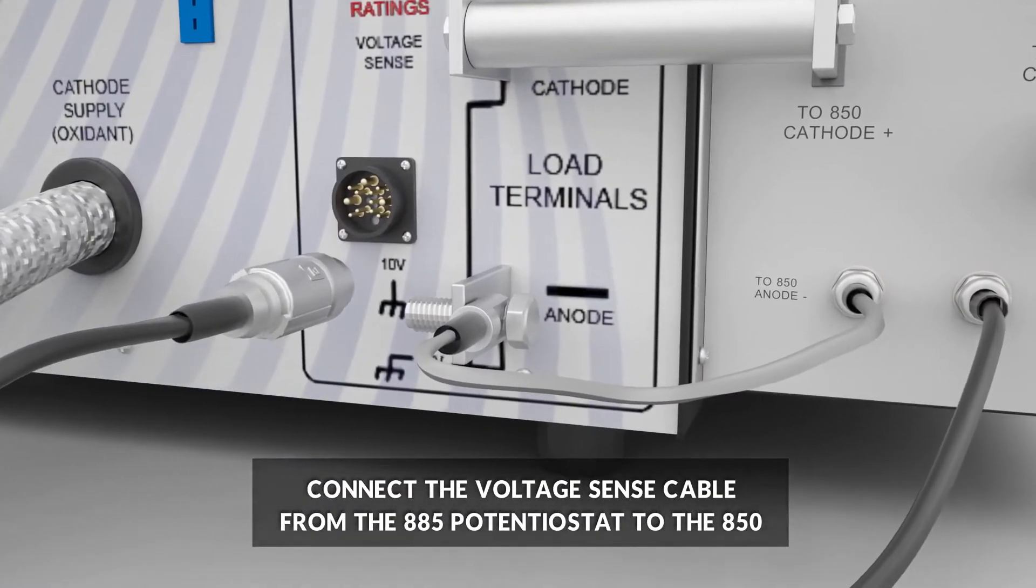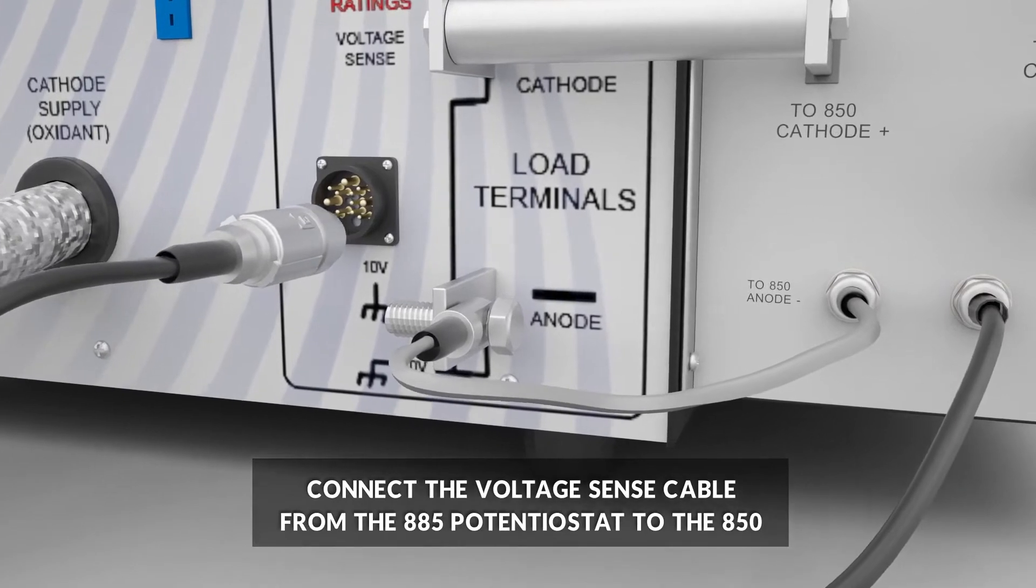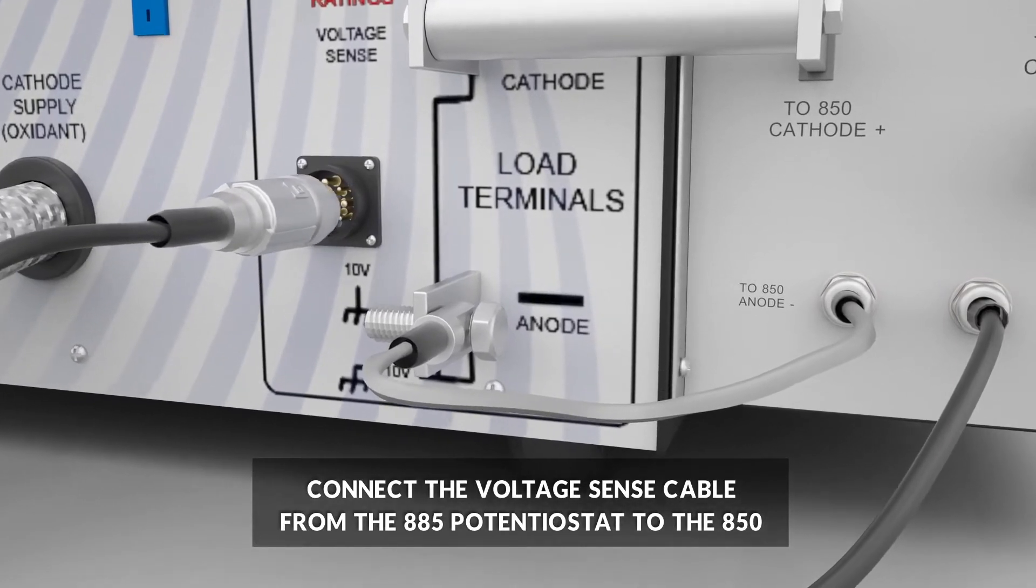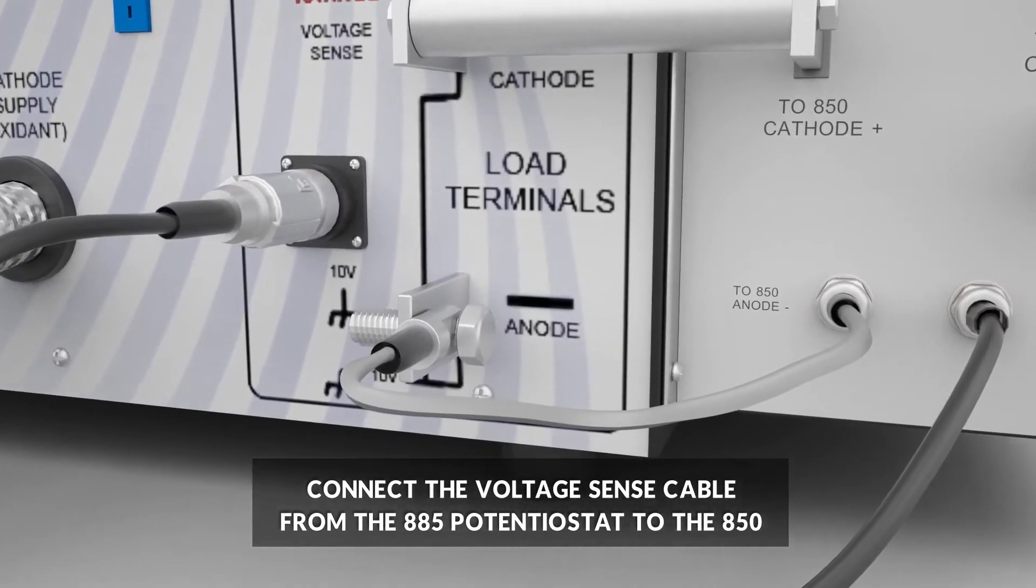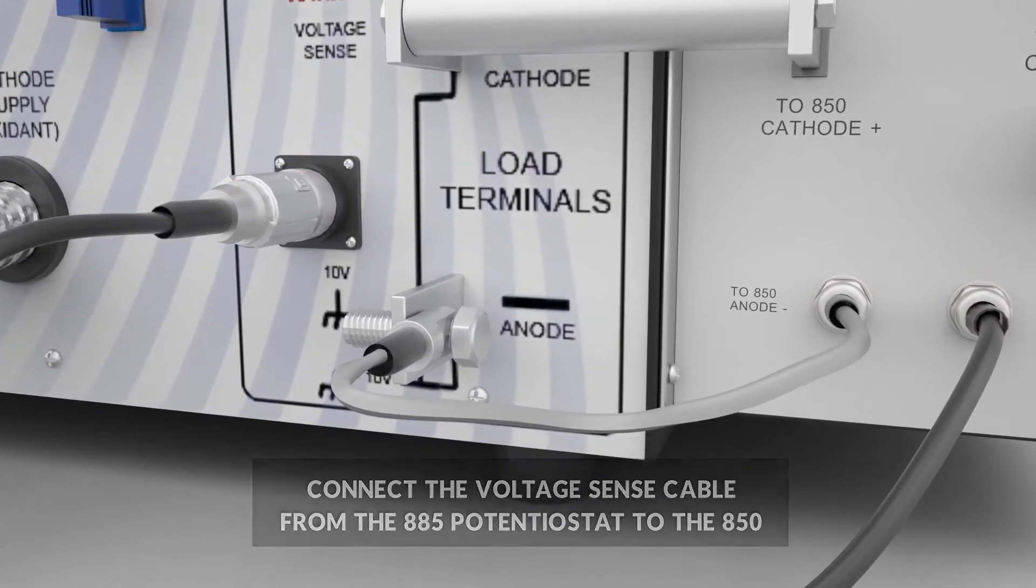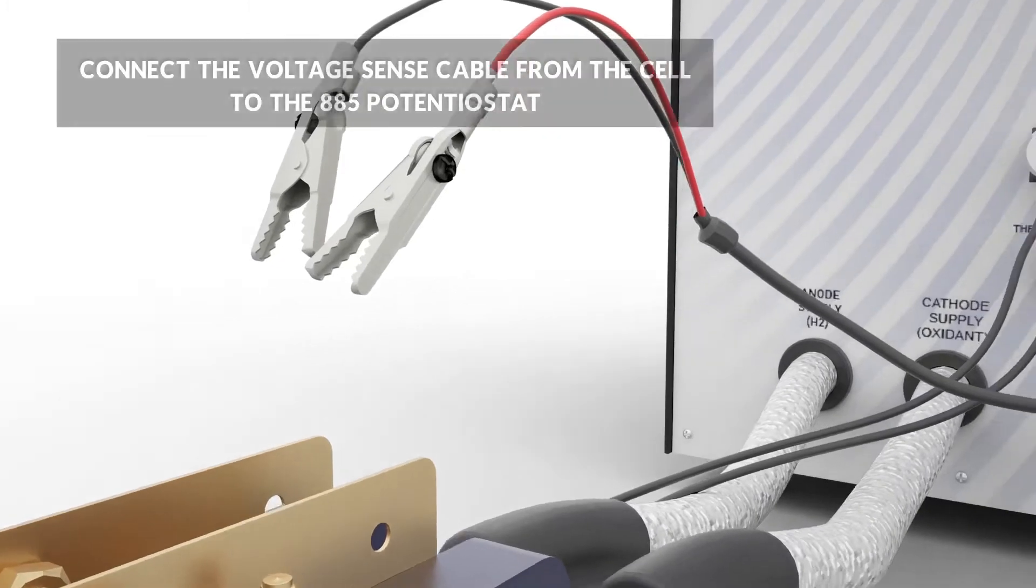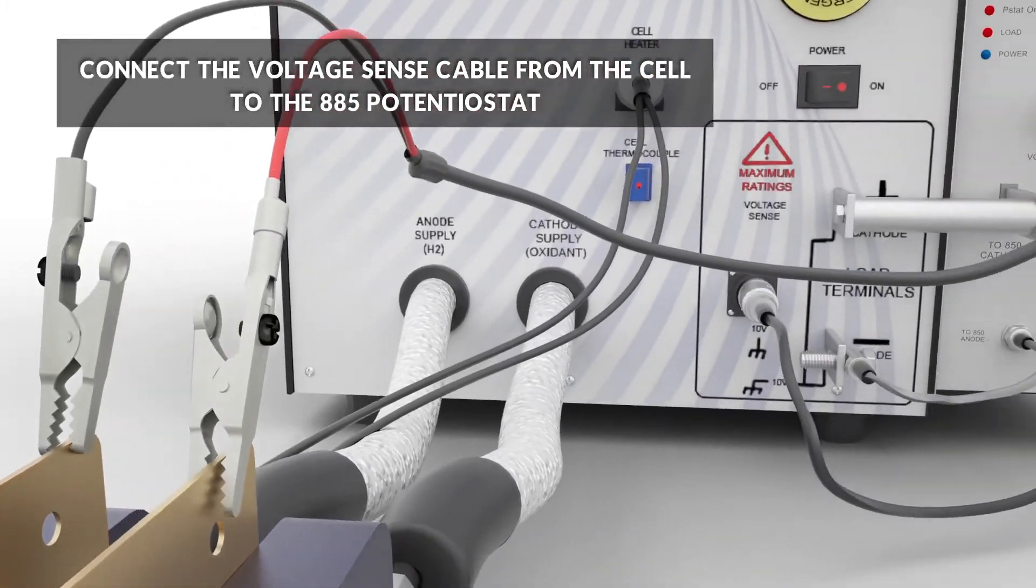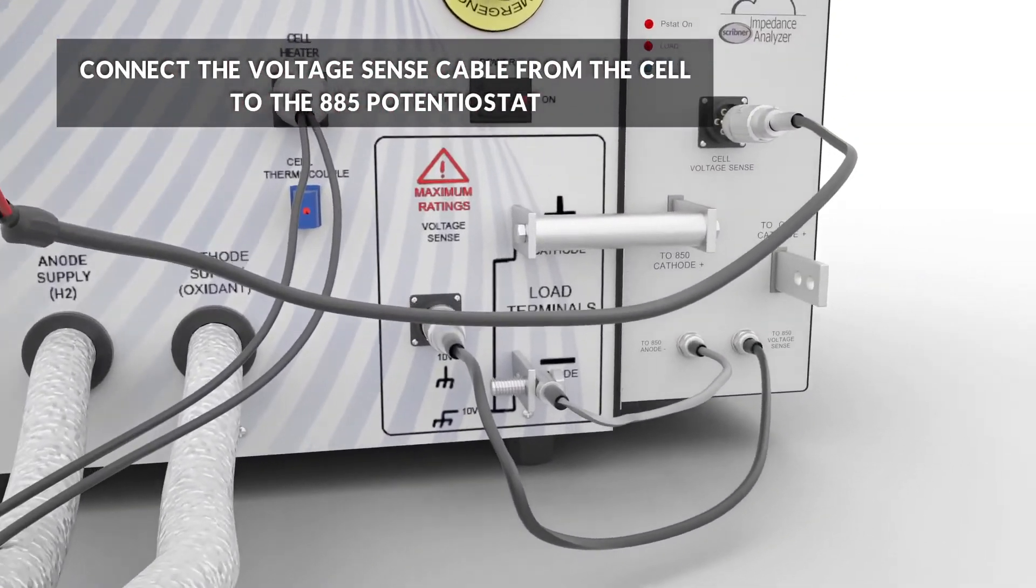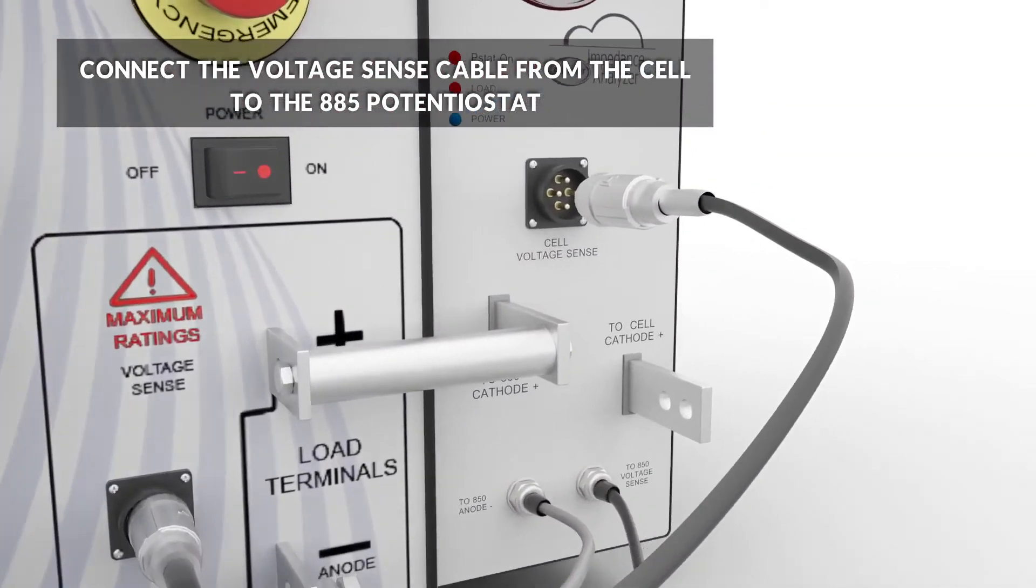Connect the cell voltage sense cable from the 885 potentiostat to the voltage sense connector on the 850. Connect the cell voltage sense cable from the cell to the 885.